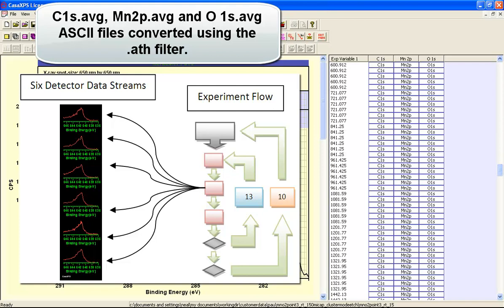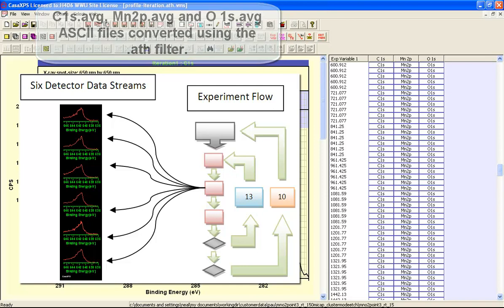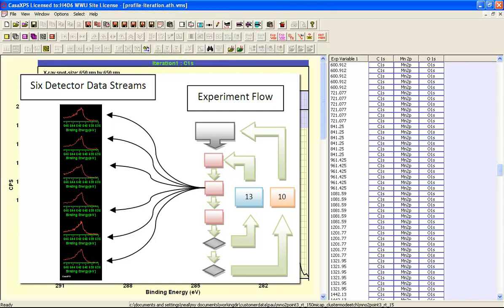And there will be ten of these in this data file. So this represents quite an intricate measurement producing quite a complex data file. And it's for this reason that the ATH file filter was necessary when converting these data.